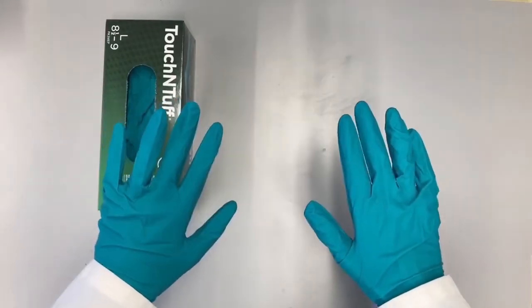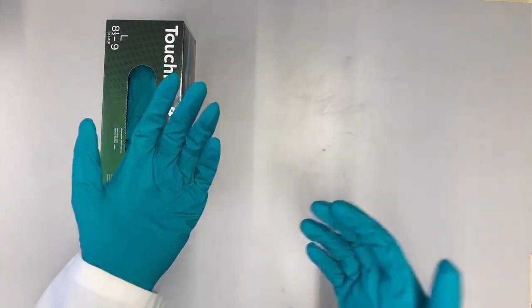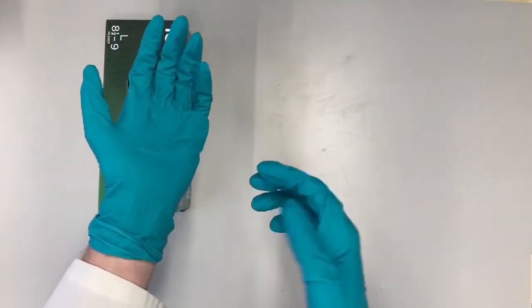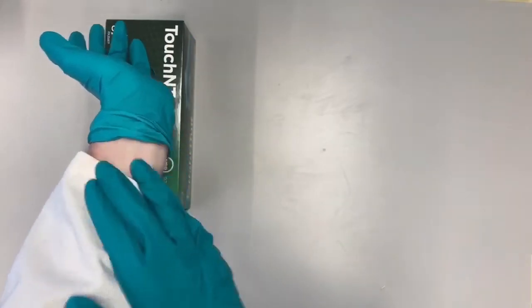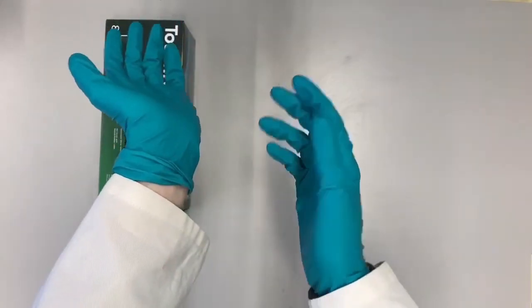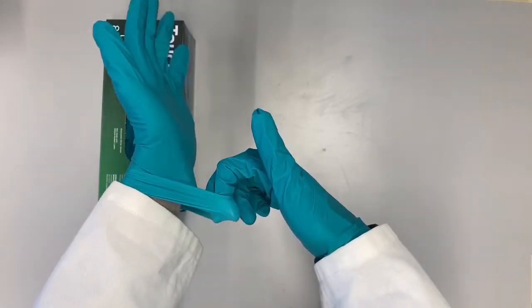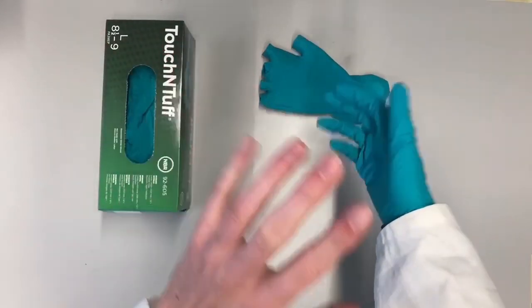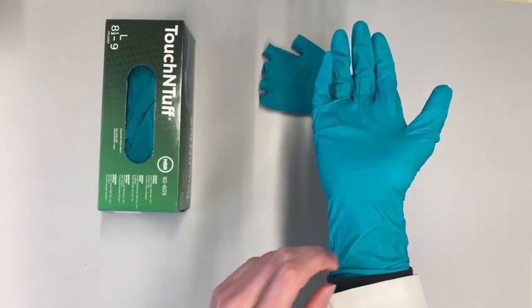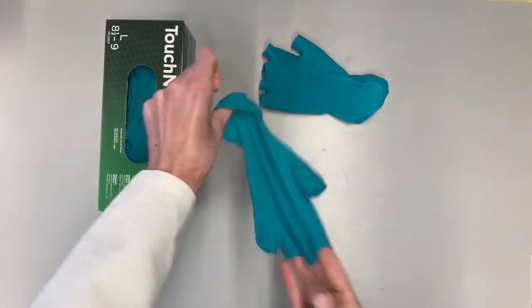When you're done working with the chemical, or when you've spilled some chemicals on your gloves, you want to take them off. But the gloves are there to protect your skin, so don't go touching your skin with your gloves and rubbing the chemical all over your arm. When you take them off, put your finger underneath the glove and pull it off. Now you have one clean hand and one gloved hand, so put your clean hand underneath the glove — because the inside of the glove should be clean — and pull it off.